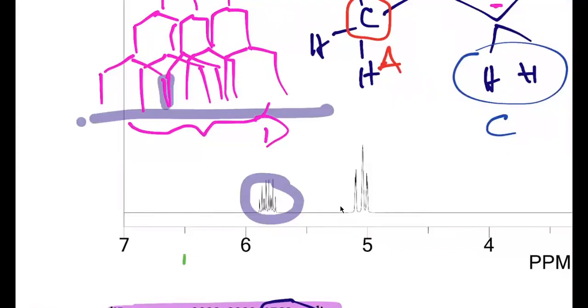Okay. Yeah, it's just the ones on the bottom. The lines on the bottom are the final number of lines in a given signal if it has complex splitting, if you parse it out during the splitting tree. I know it's kind of sloppy looking, but some of those are going to overlap. So what should be 12 lines, you end up with 10. What that means is that within that splitting tree, you have some overlap between some of those signals.